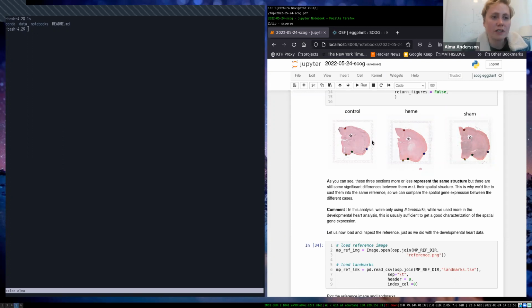I actually did something similar to that, if I interpret this suggestion correctly, in the manuscript, where we can see how different gene expression positions or patterns are perturbed in the transferred versus the observed state. I think that's hyper relevant, but maybe that's actually something that could be included here as a feature as well in the actual code base. So I'm going to thank you for that suggestion, and think about a nice way of implementing that. So yeah, nice. Thank you to whoever commented on that.